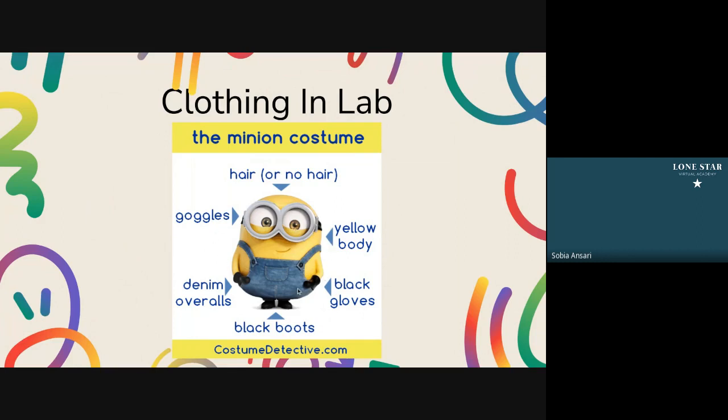You need to have gloves on when needed, especially when working with chemicals. You don't know which chemicals will be a skin irritant, which chemical could burn your skin, etc. So always have your PPE, your protective equipment, on.